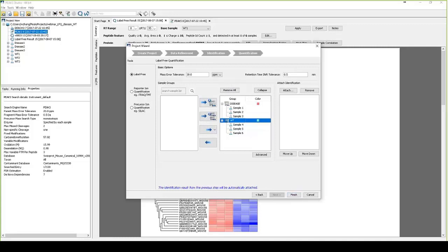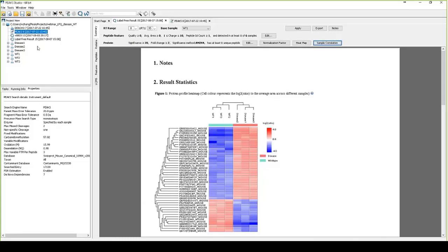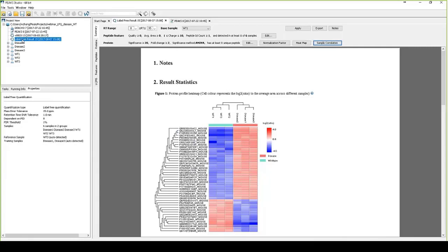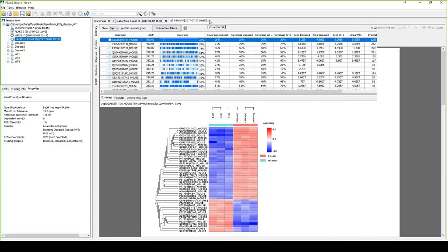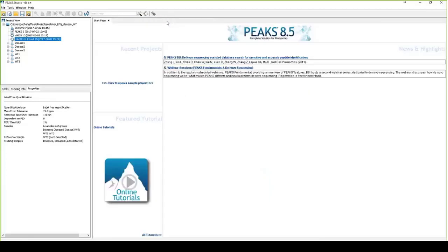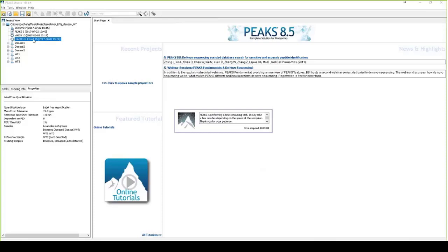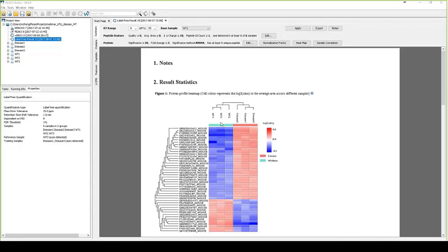To save time, I will not run this whole procedure during the webinar, but I have the project already finished running and open here. So I will show you the results directly. Under this project, you see we have first a de novo sequencing result, and then database search result to give peptide and protein IDs, and finally followed by LFQ result. So I double-click the LFQ result. I need to reopen the result node. This may take a while if you have a very large dataset.